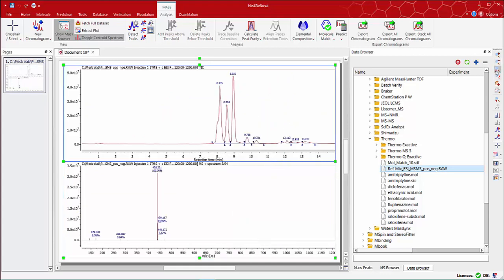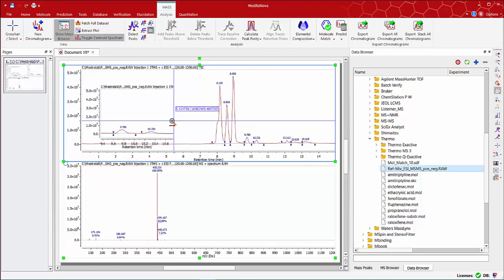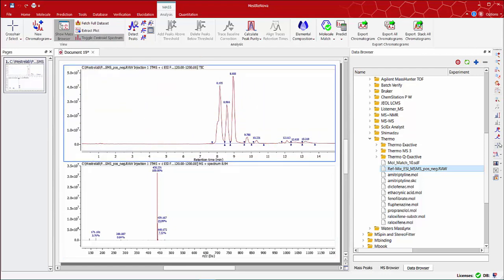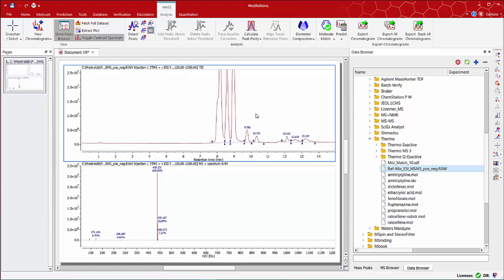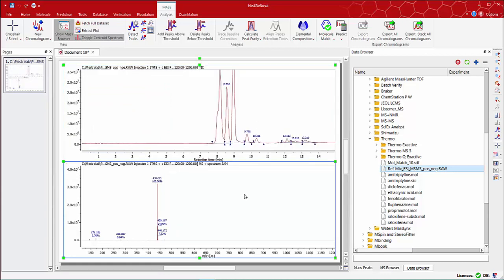Add an expanded region to your TIC data, change the peak intensity scale just by using the mouse wheel or by clicking on the icons in the side toolbar.